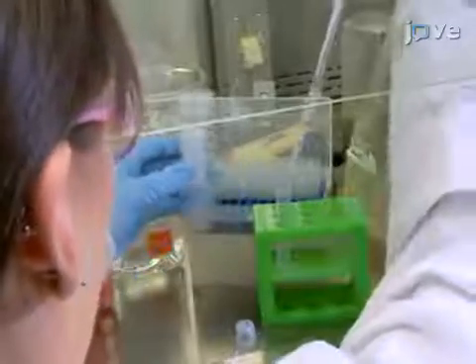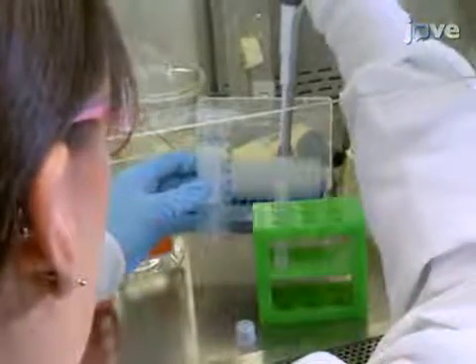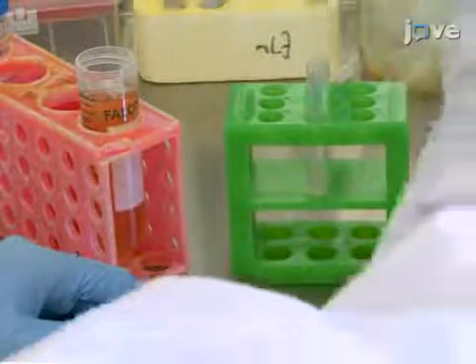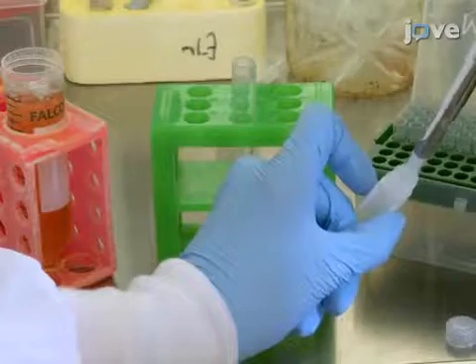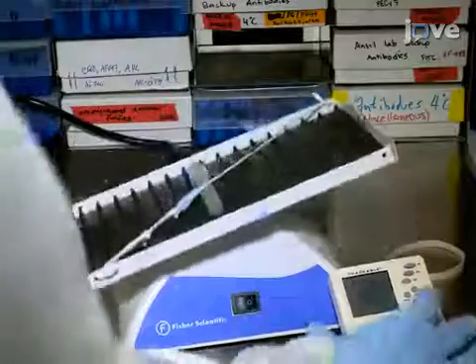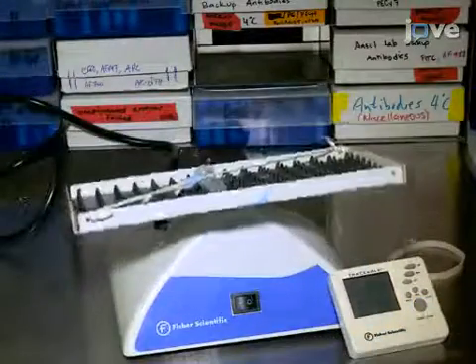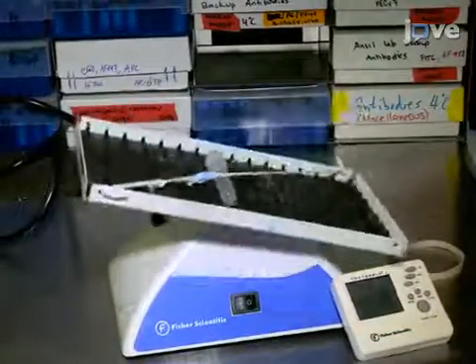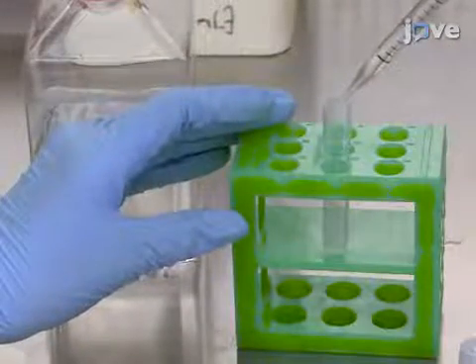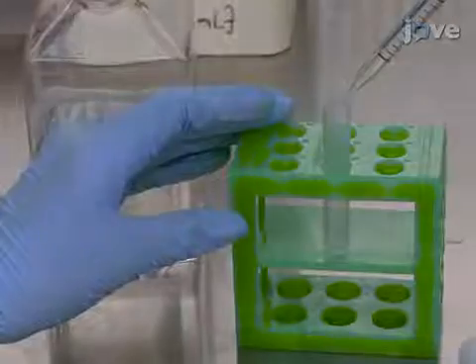Transfer the cells to a new 5 milliliter tube, then add 100 microliters of fetal bovine serum, or FBS, and 100 microliters of the antibody mix per tube. Then incubate each tube at 4 degrees Celsius for 20 minutes on an orbital shaker to mix well. After the incubation, add 3 to 4 milliliters of isolation buffer to wash the cells, then centrifuge the cells.